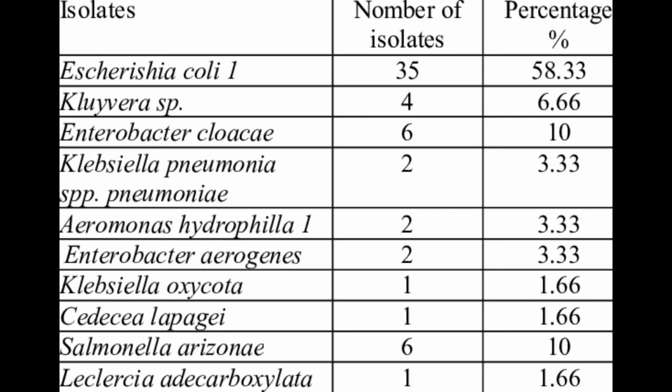Now let's discuss the citrate utilization test, which uses citratase. Their medium is Simmons citrate agar slant, or SCA, containing sodium citrate, ammonium salts, and bromothymol blue. The positive is a blue medium and growth on the slant, producing NaHCO3 and NH3. The negative is a green medium and no growth on the slant.